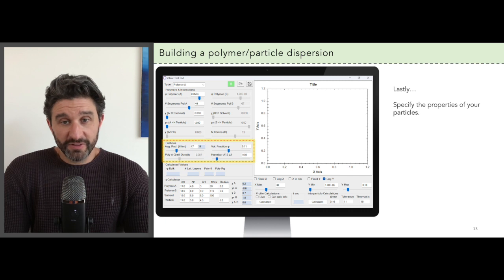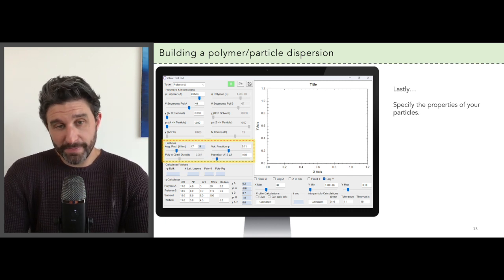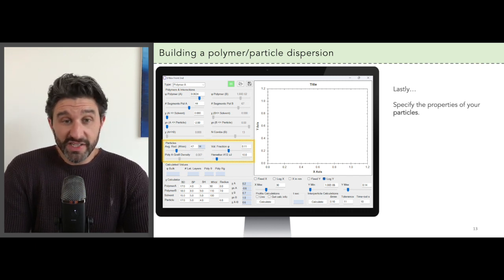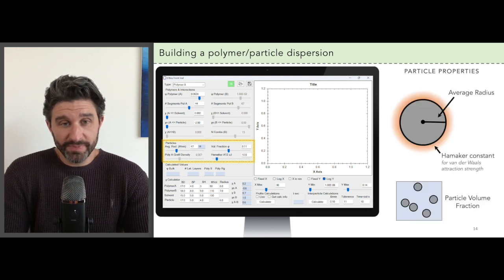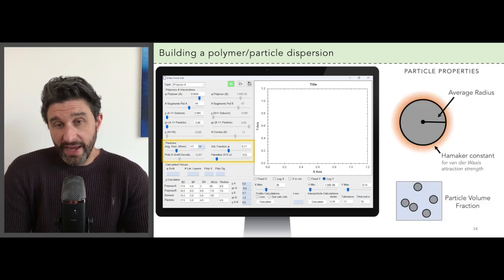Now the last step is to specify the properties for the particles in your dispersion. This is actually really straightforward. You first specify the radius of the particles. This is just an average.